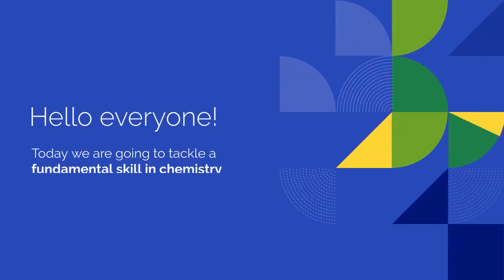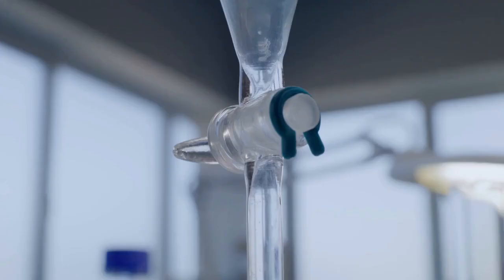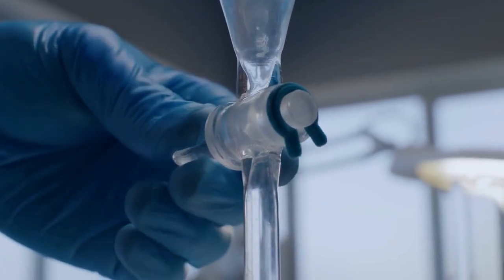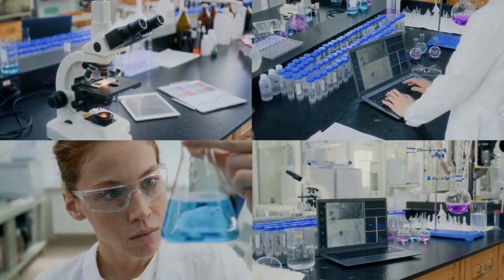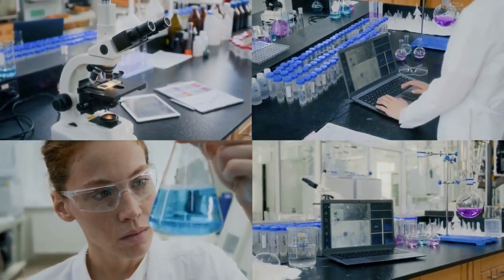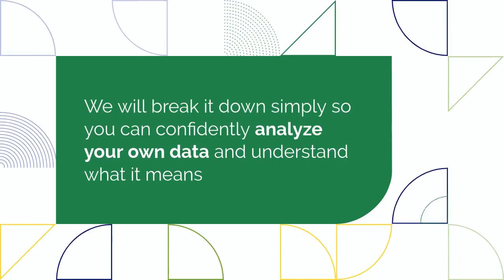Hello everyone! Today, we are going to tackle a fundamental skill in chemistry: how to calculate ratios from a gas chromatography, or GC, analysis. It might sound complicated, but the process is actually very straightforward once you understand the steps. We will break it down simply, so you can confidently analyze your own data and understand what it means.